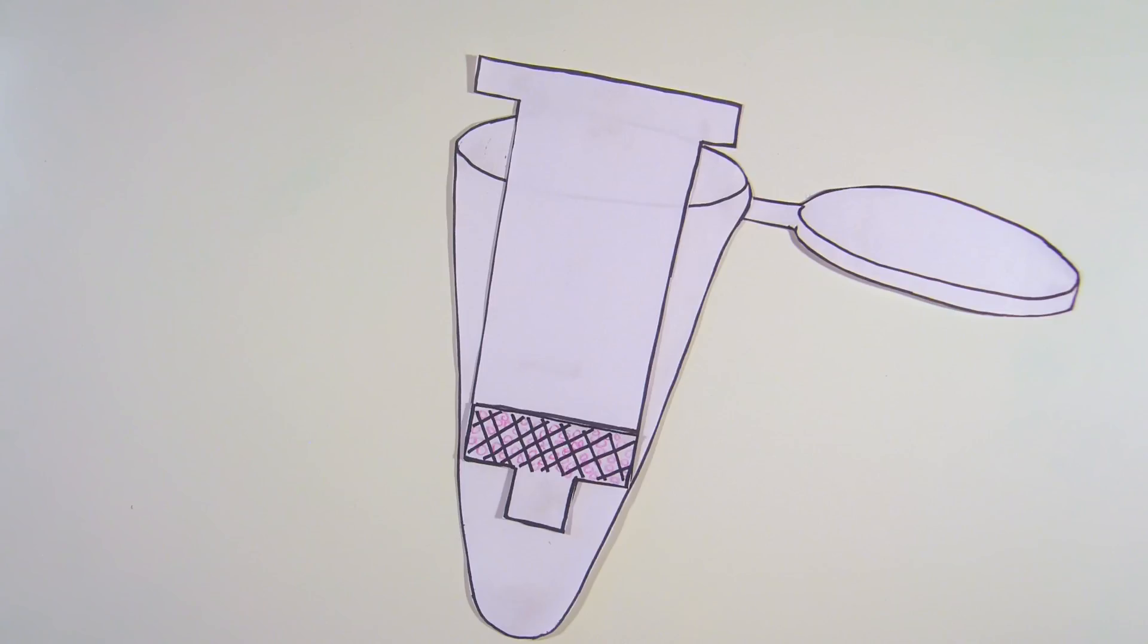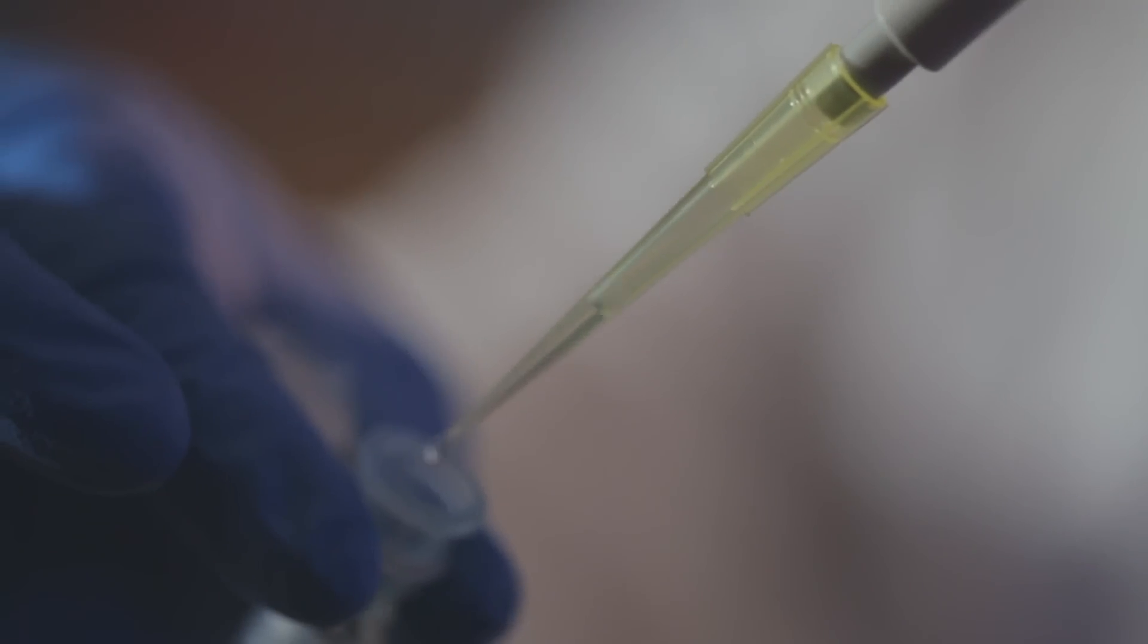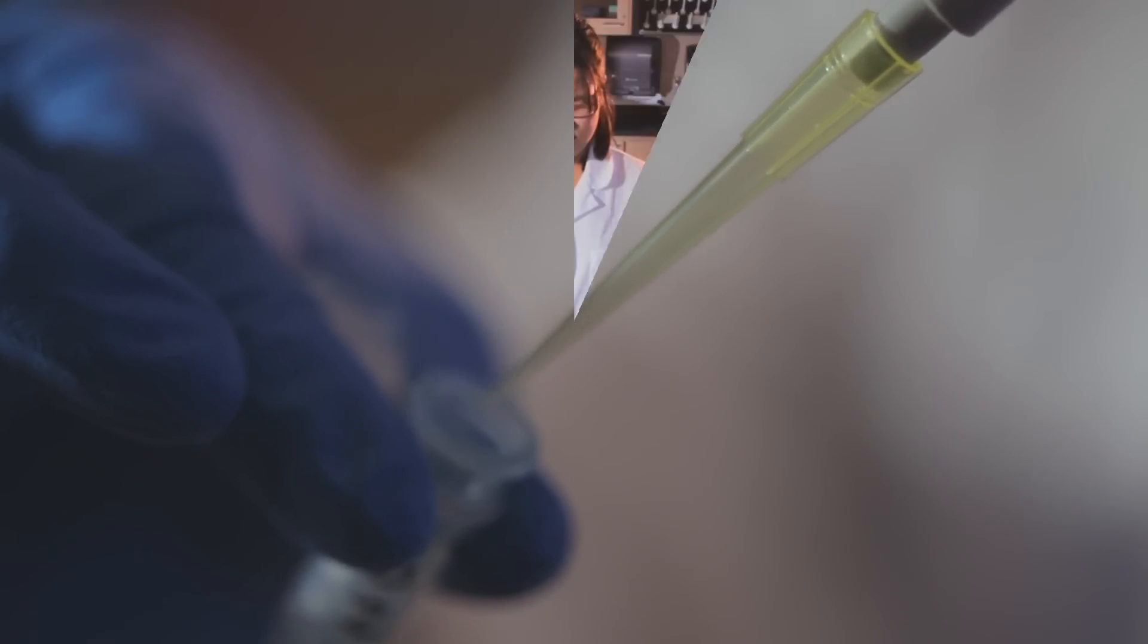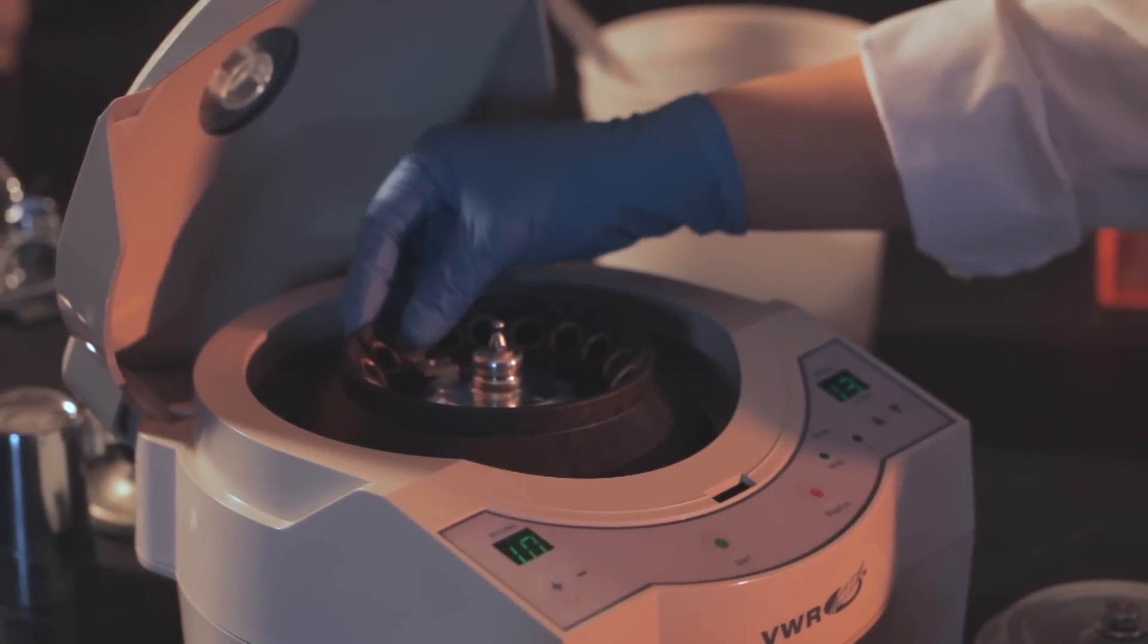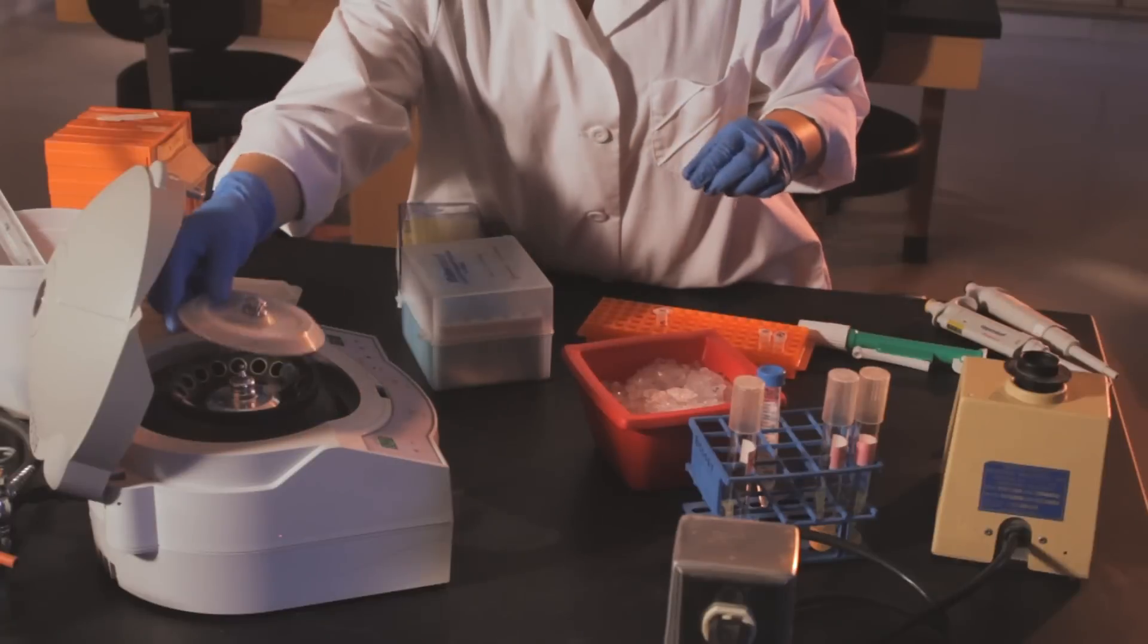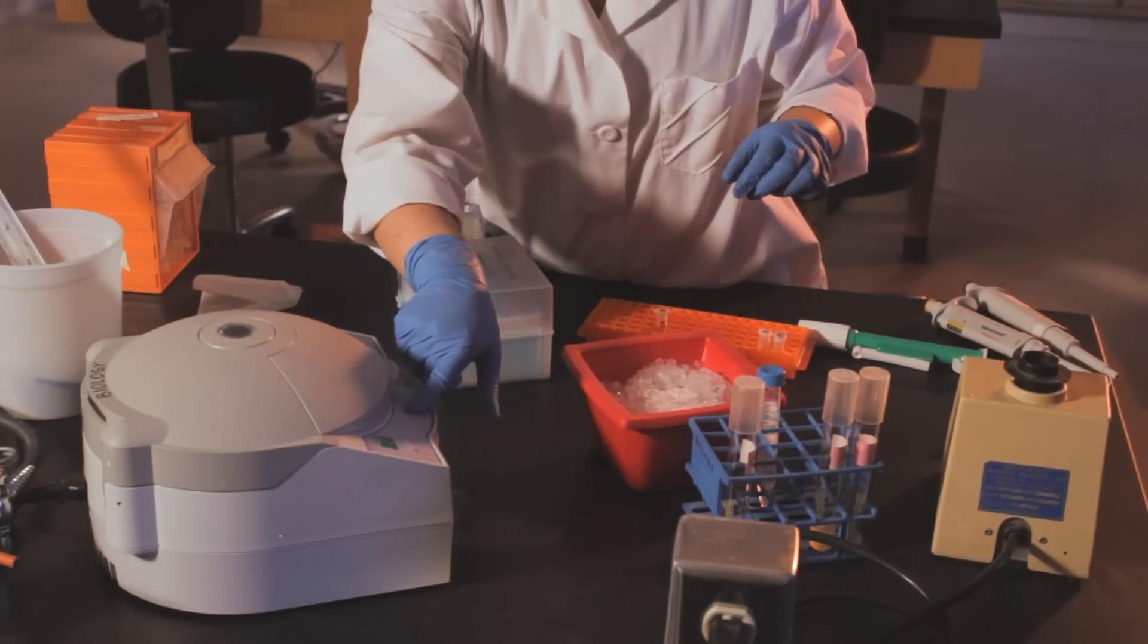Add 50 microliters of elution buffer directly to the membrane in the spin column. Let the spin column stand one minute while the DNA becomes solubilized. Then, centrifuge the column and tube for one minute. The microfuge tube caps will not close, so be sure that the caps are facing toward the center of the centrifuge so that they do not break off while spinning.